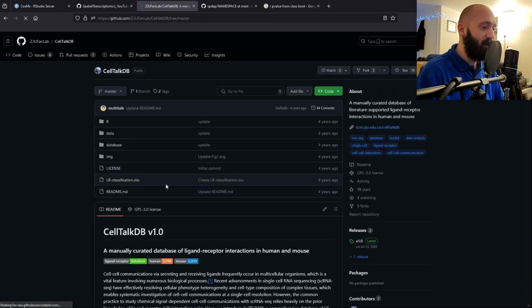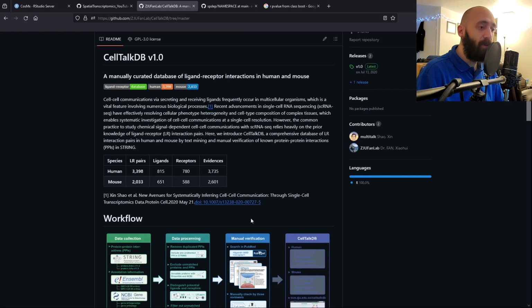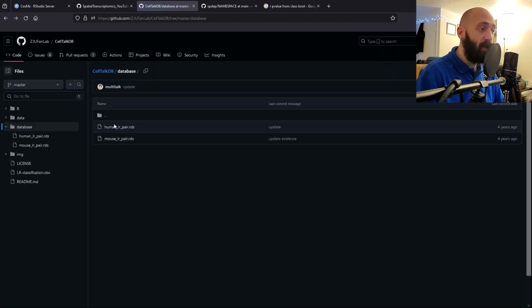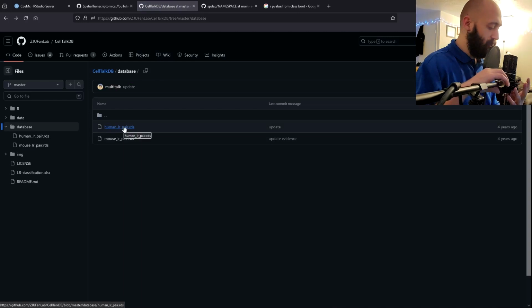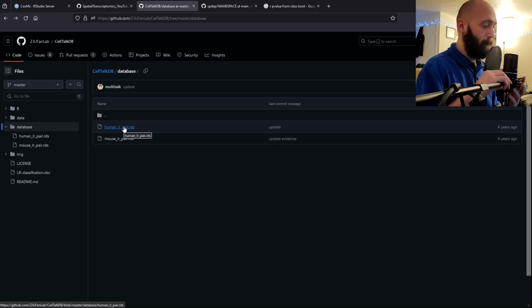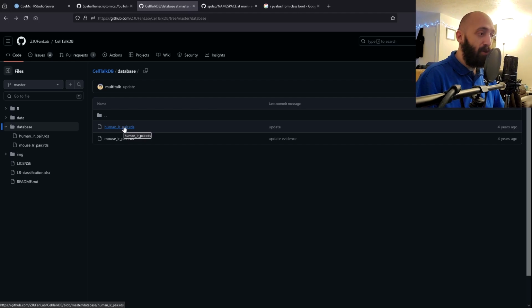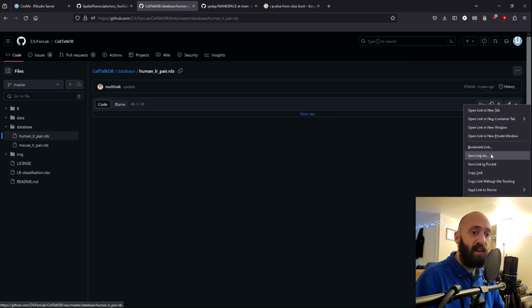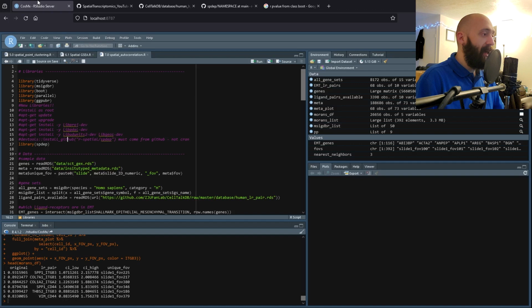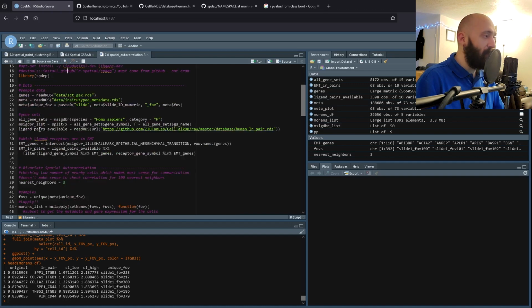So if we go back to this homepage here, they do have a paper. Feel free to go ahead and read that. What we're going to use is the human ligand-receptor pair gene list. Let me adjust this here quick. In order to use that, you can just right-click and select copy link. Inside of RStudio, to get that loaded up, you can paste the link into readRDS, since it's an RDS file, and specify that it's a URL. That's going to download and import it right into R, so you don't have to save it to your machine.